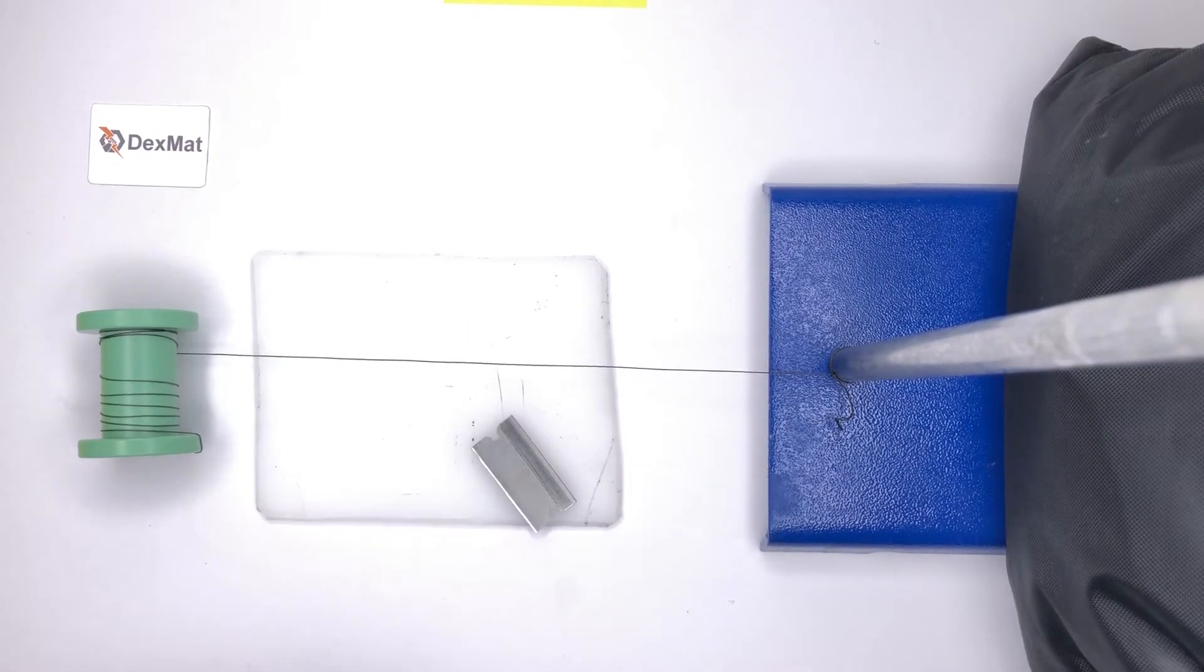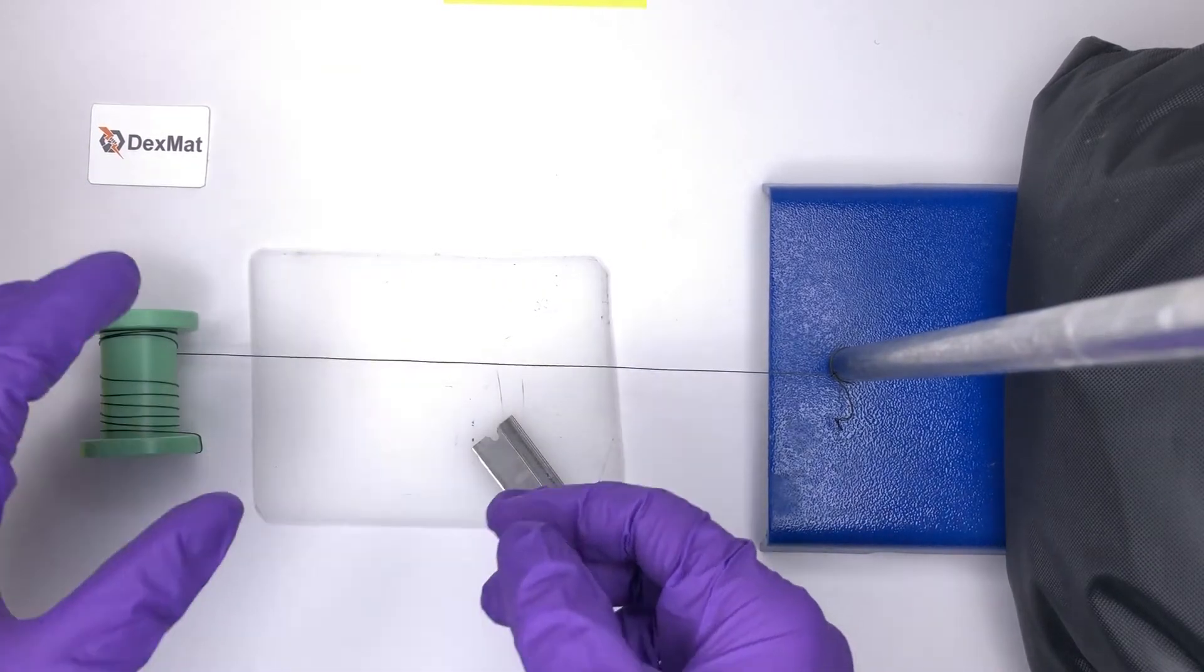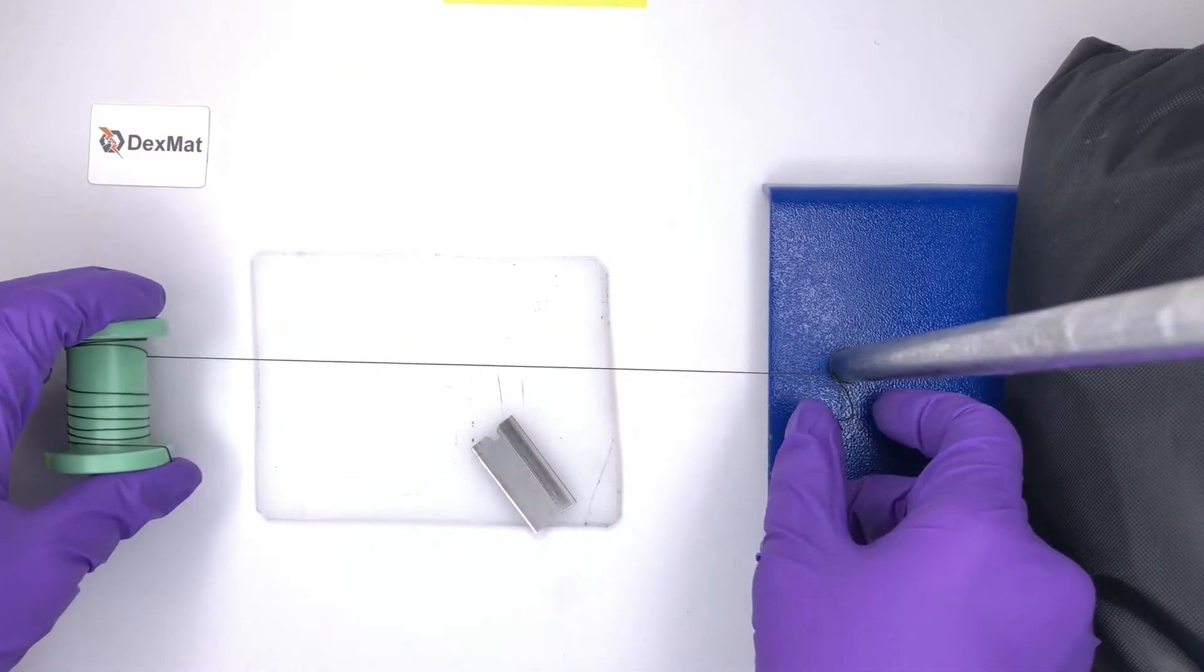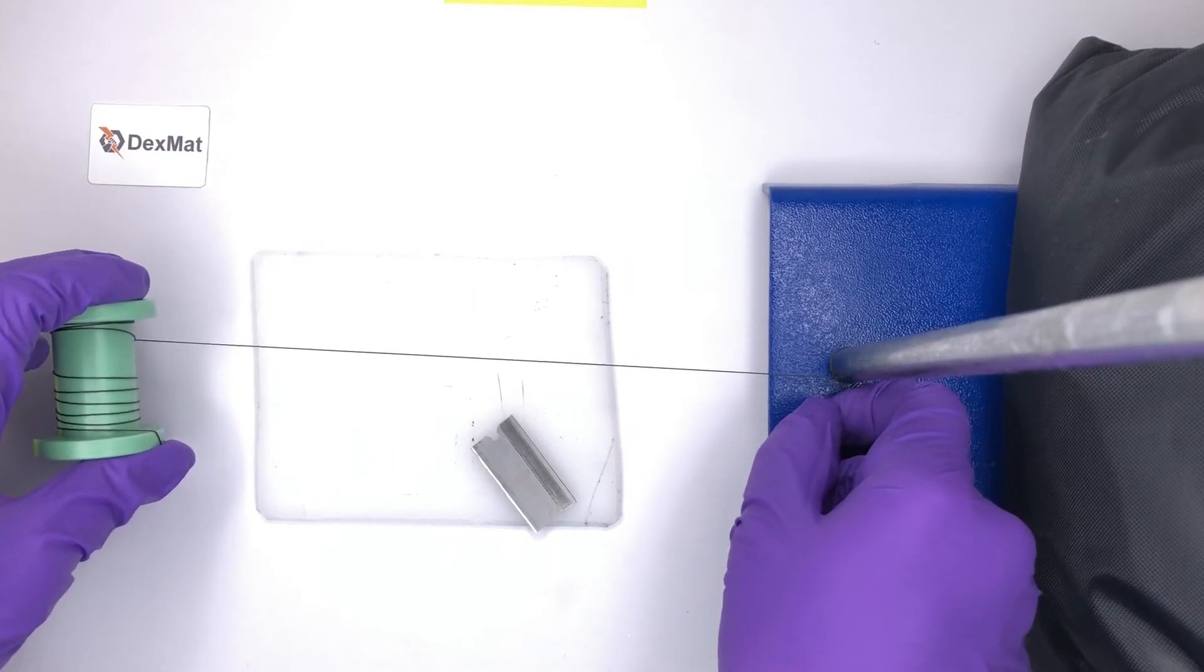The best method we've discovered for cutting these carbon nanotube yarns is to put them under tension, which I've done here by double knotting the yarn onto this pole.